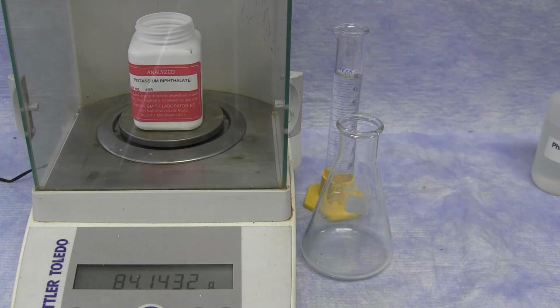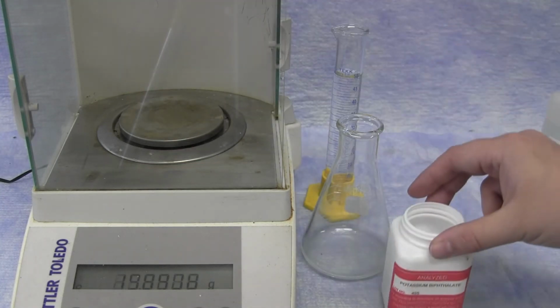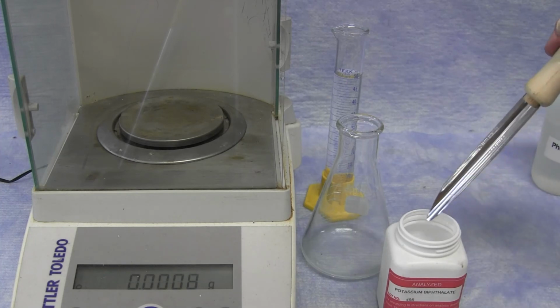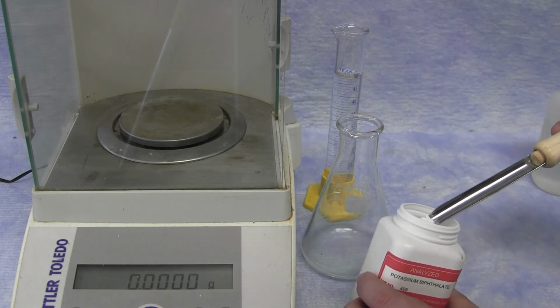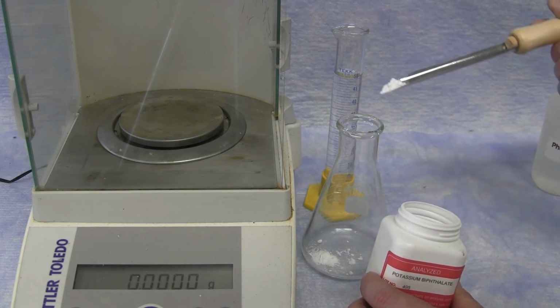With the starting mass of the container and the sample known, you can then remove some of the material and add this to your Erlenmeyer flask.